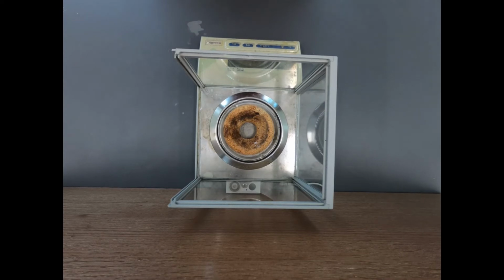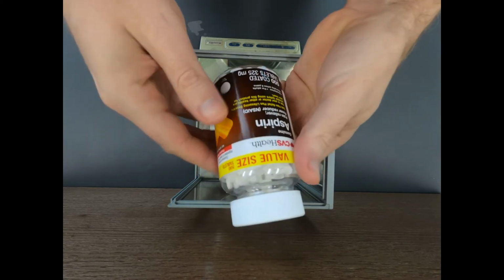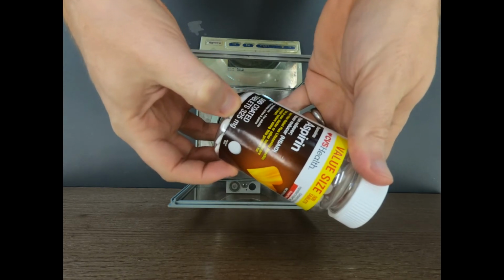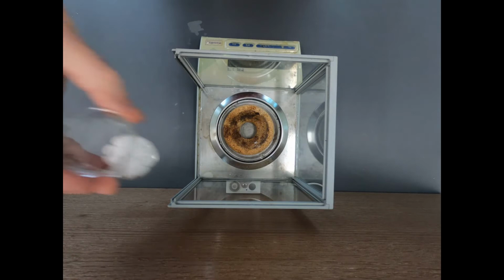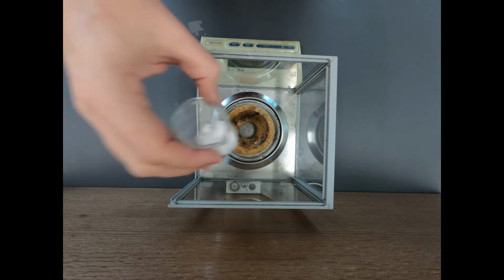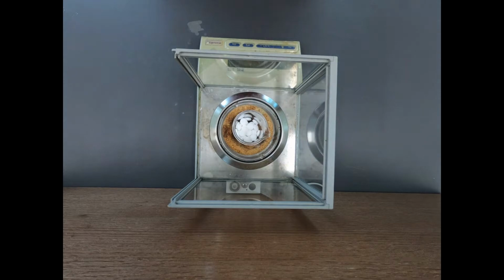Okay, we're at the balance and we're ready to start this experiment. So what we have are some tablets. These are aspirin tablets. Each tablet contains about 325 milligrams of the active ingredient, which is aspirin. So for the procedure, we need 30 tablets, and in this small 50 milliliter beaker are 30 tablets. The balance is already tared for the weight of this beaker. So when I put this on the balance, we get a mass of 11.31 grams.